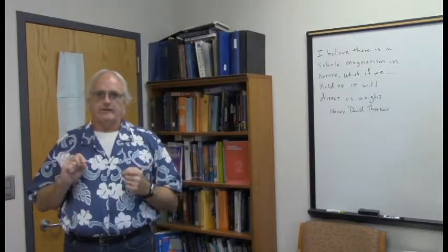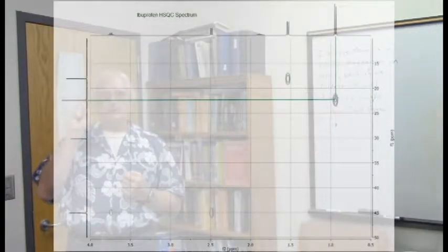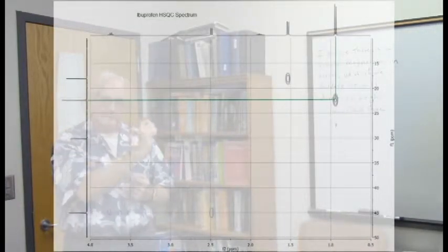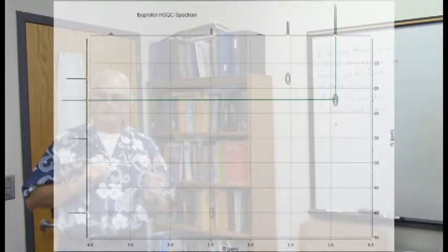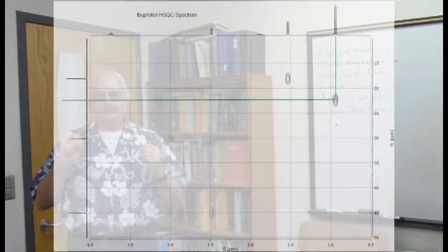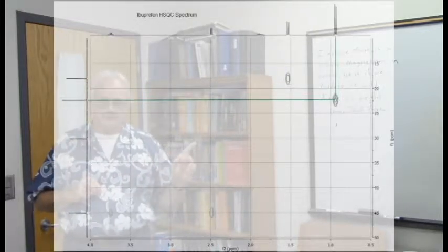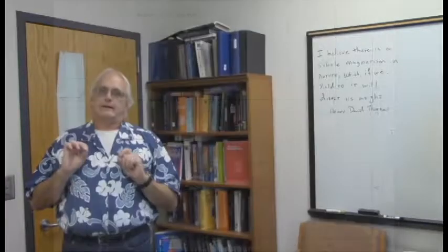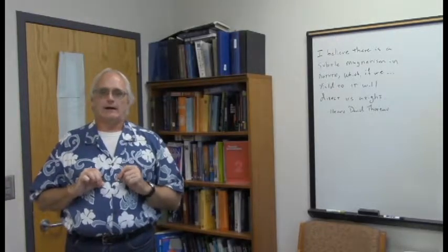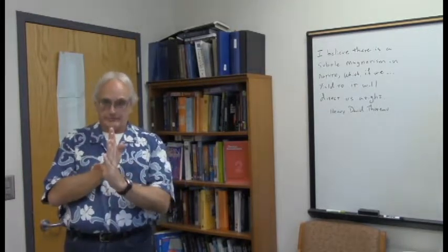If we, on the HSQC, draw our vertical line until we come to the crosspeak, and once we're there, we turn and go to the carbon axis, we see here is the carbon signal of the 2 equivalent methyl groups. It tells us which carbon is attached to which set of protons. The interesting one is that carbon that the DEPT 135 reveals is actually 2 signals.